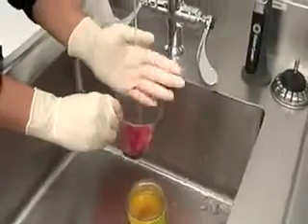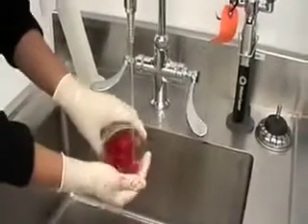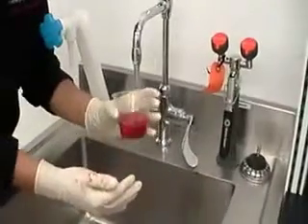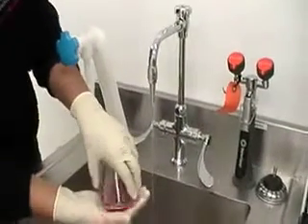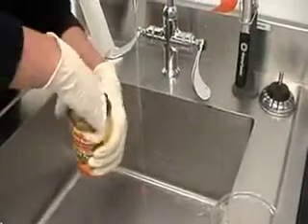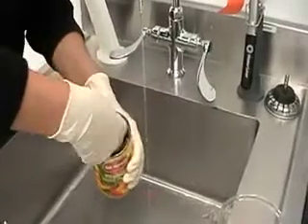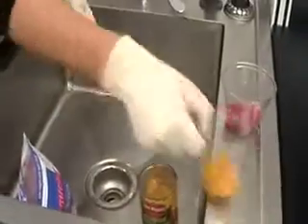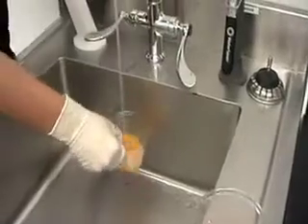Just throw them in a cup and rinse them a couple of times. Okay, good enough. And then you're going to want to do the same thing with your canned peaches. So you'll just take two or three of these little quarters of peaches, and you can put them in a cup to rinse them. And again, we'll just give them a nice quick little rinse.